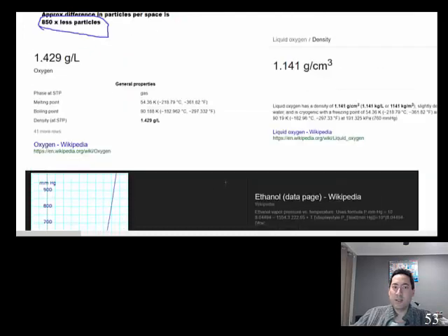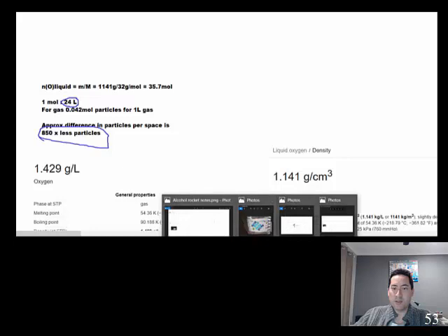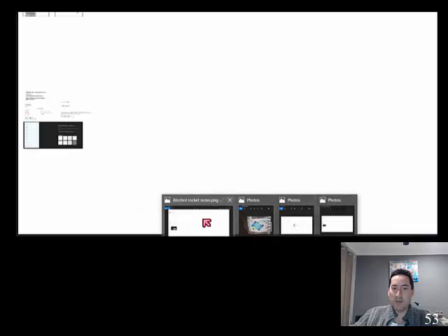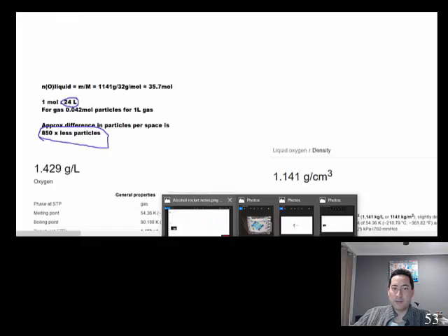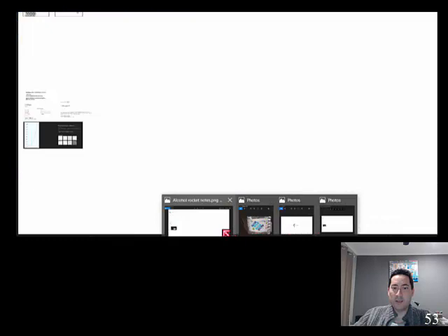So that being said, just have the students stand well back. That particular experiment was just me practicing it, so I haven't had students in it. I might have them sort of in the room still, peering out the windows or something. I'm not quite sure what to do with that one yet.